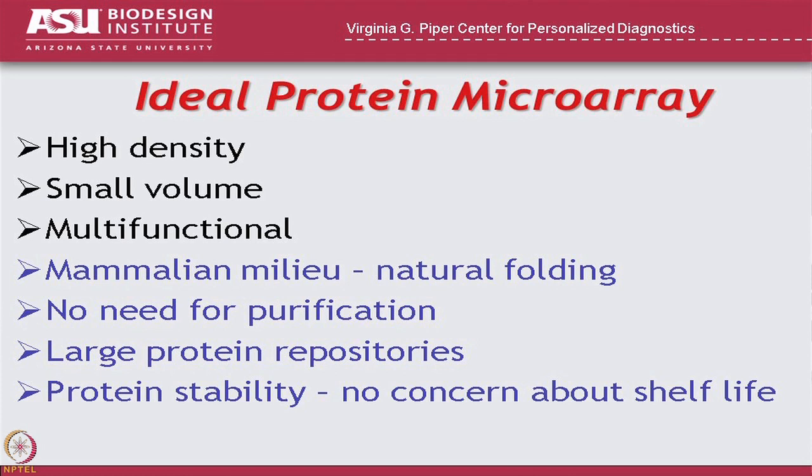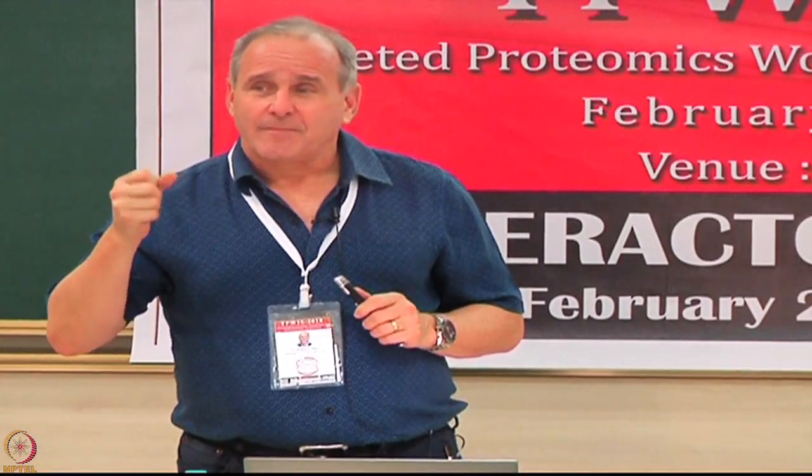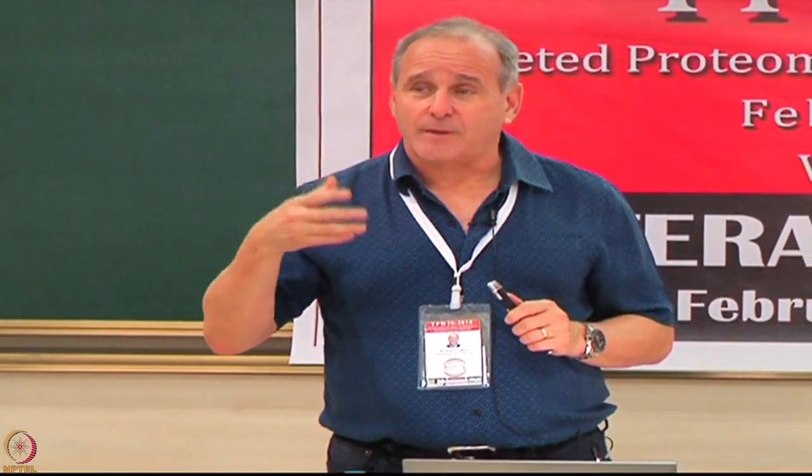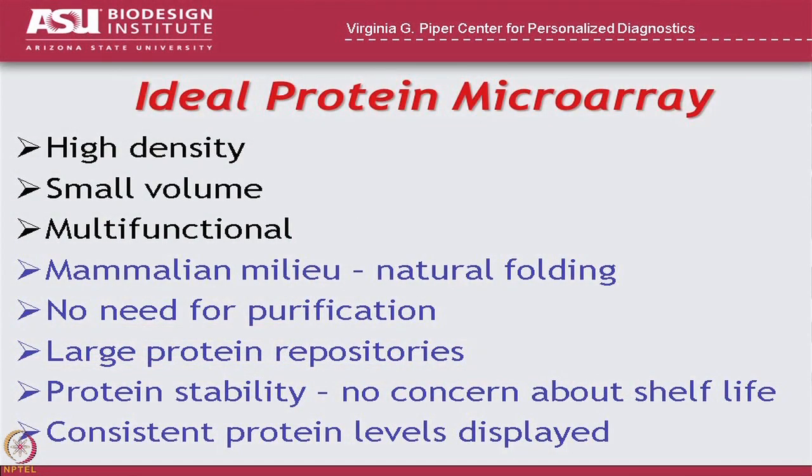Once you print the protein on a chip, there's always this worry that the clock is starting. And the longer it sits there, the more likely it is to stop being active or being well folded. And of course, you want the levels of protein from one spot to the other to be very consistent. Those are the things that you'd really like.